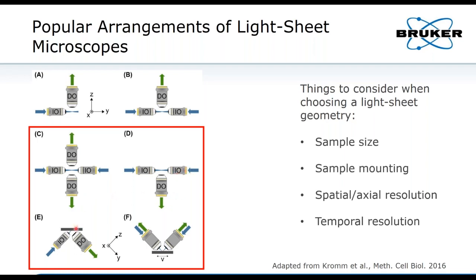A third approach is another inverted light sheet microscope, which you see here in panel E, where we illuminate from one side under 30 to 45 degrees illumination angle, and we detect in another perpendicular direction to collect light from the sample that is then mounted in a quite conventional inverted approach. And alternatively, you could also flip everything around to look at your sample with 2 objective lenses from above for illumination and for detection. And in the following, I will basically explain to you what you might want to use for which application and how we covered this with our technology approach.